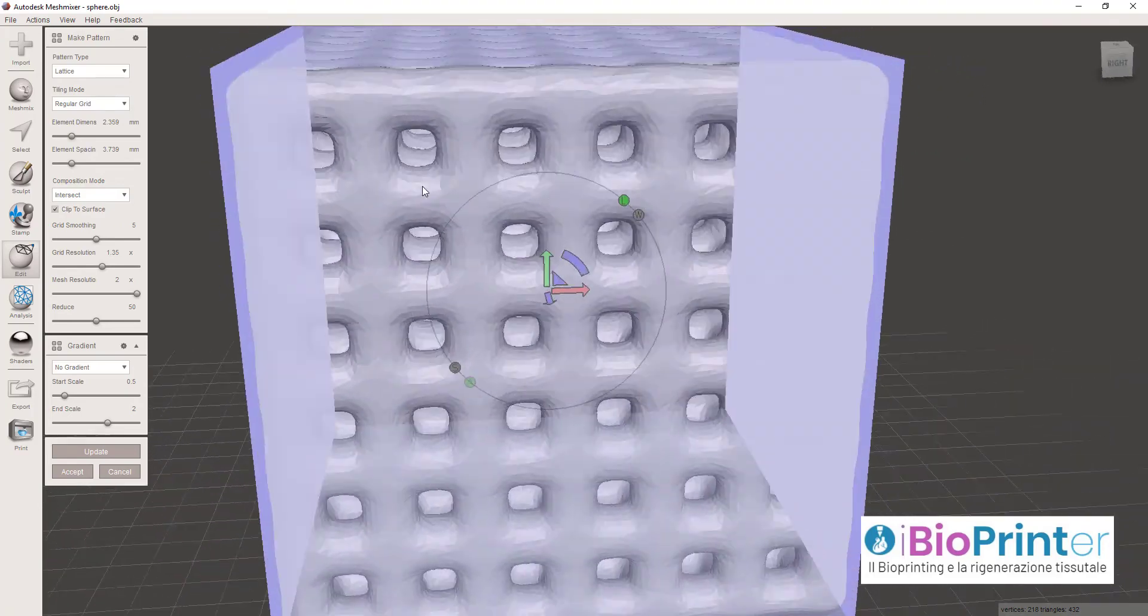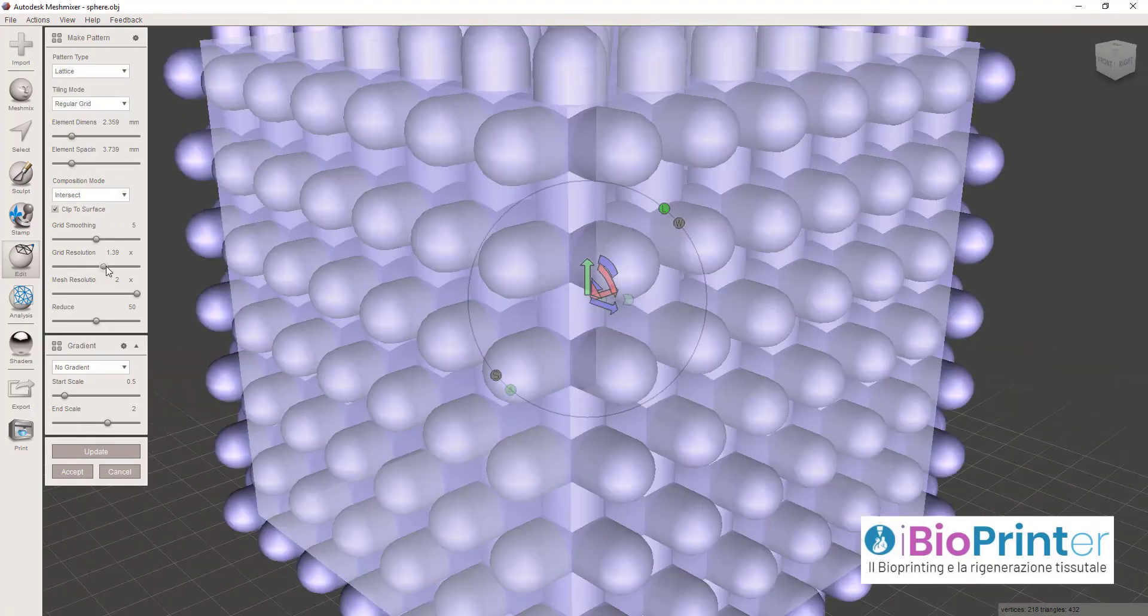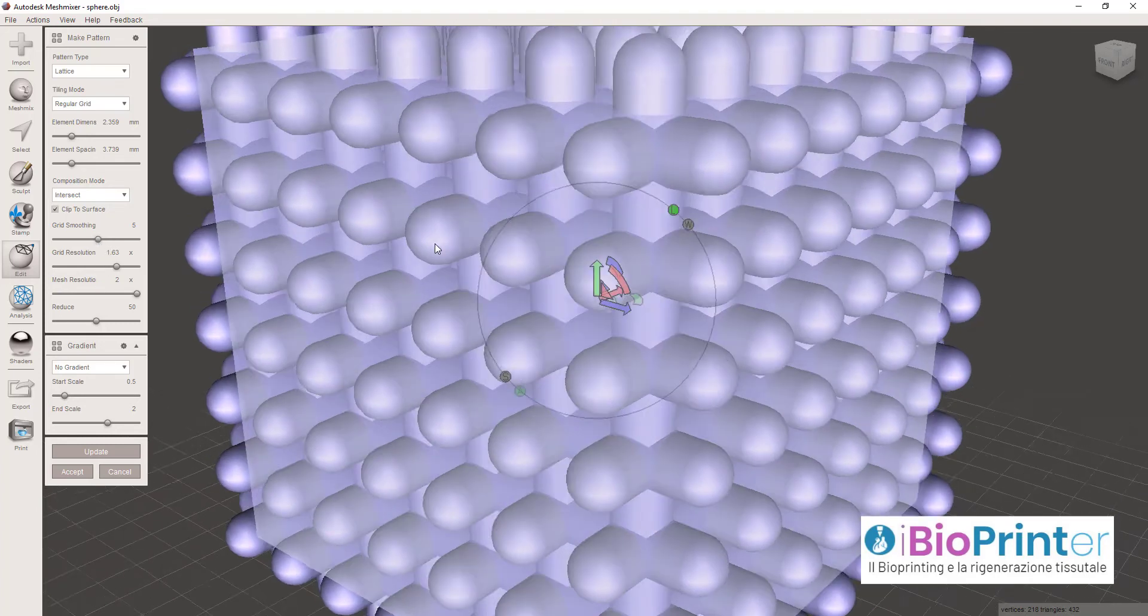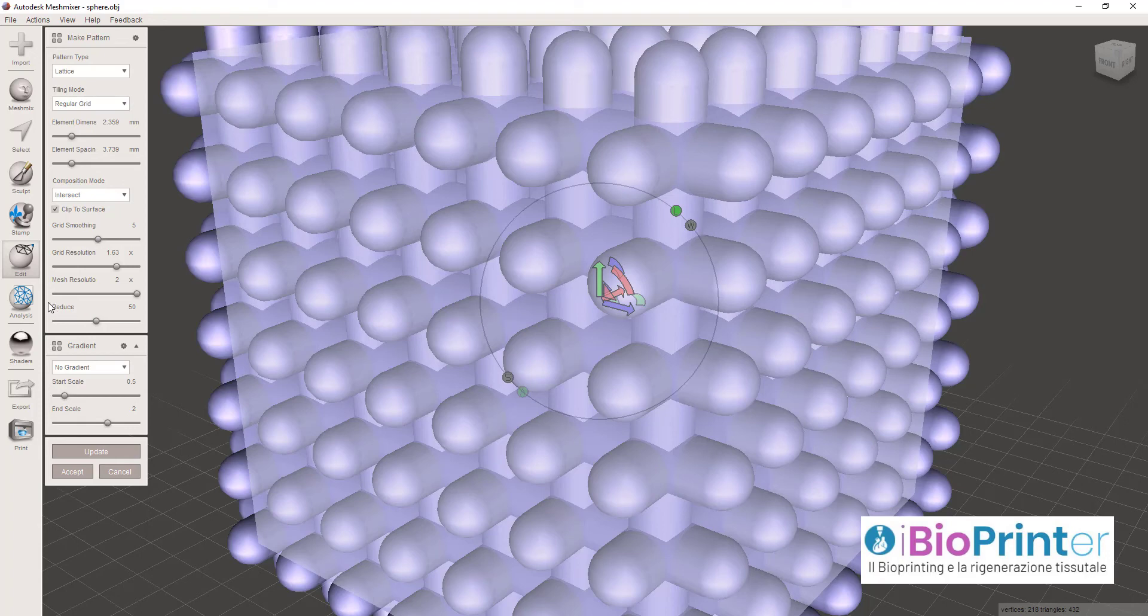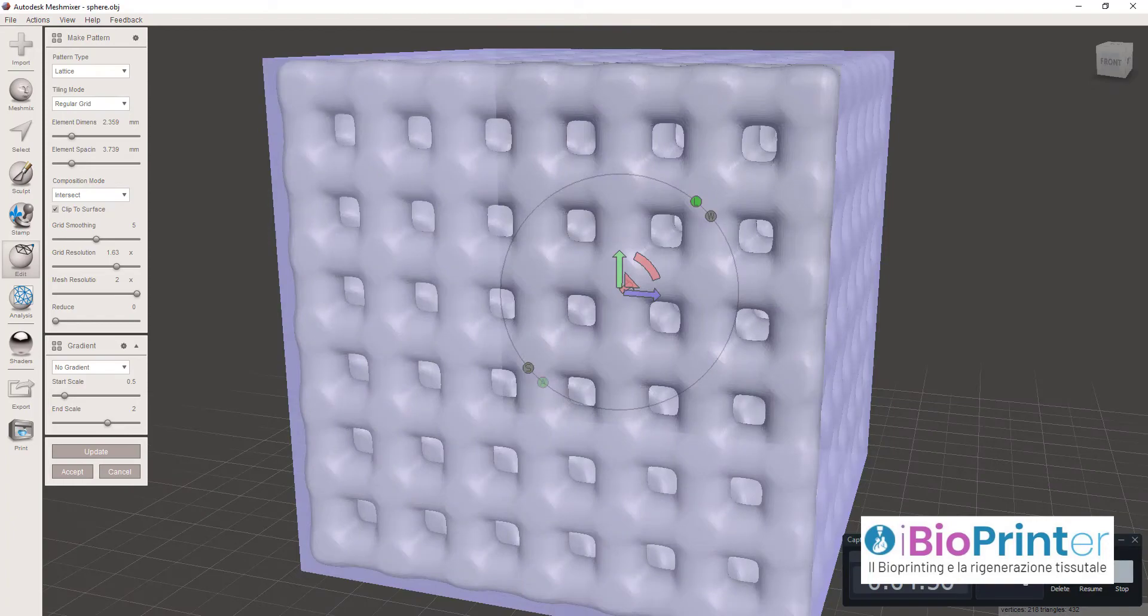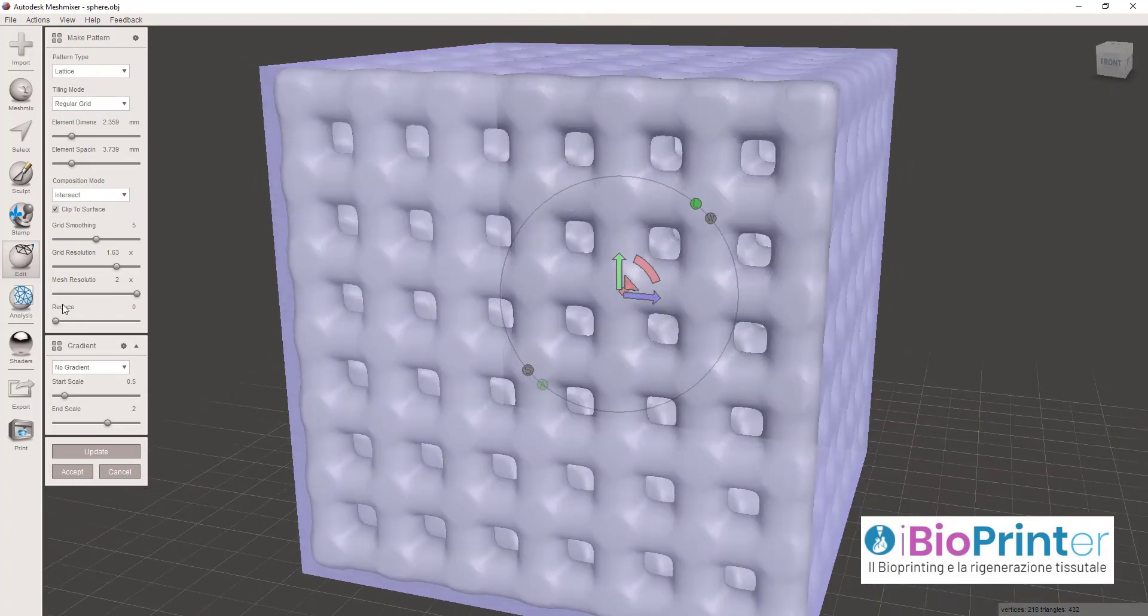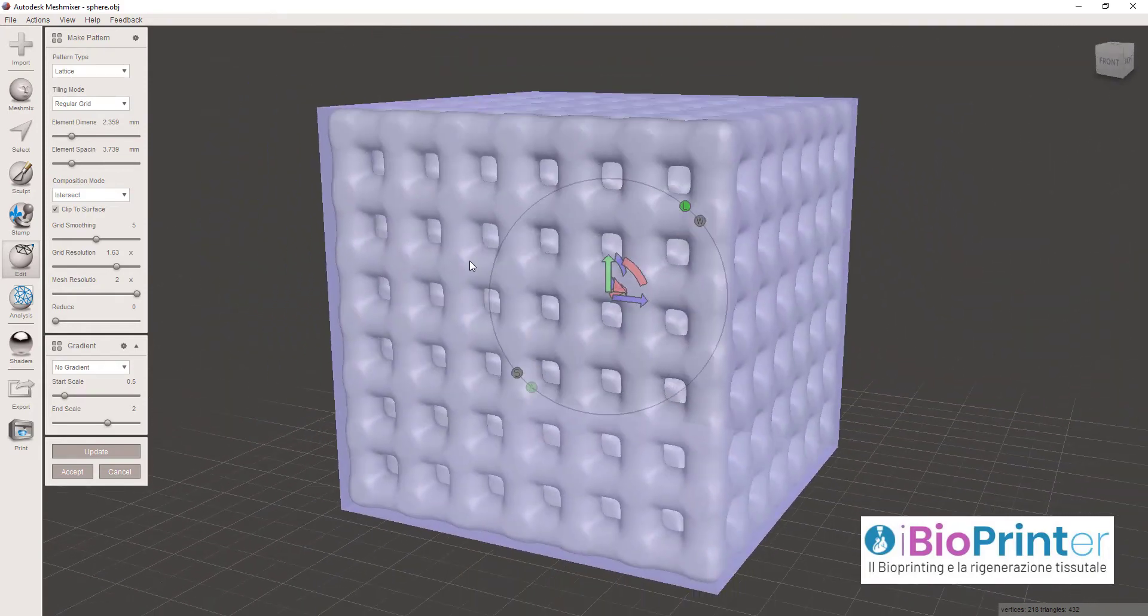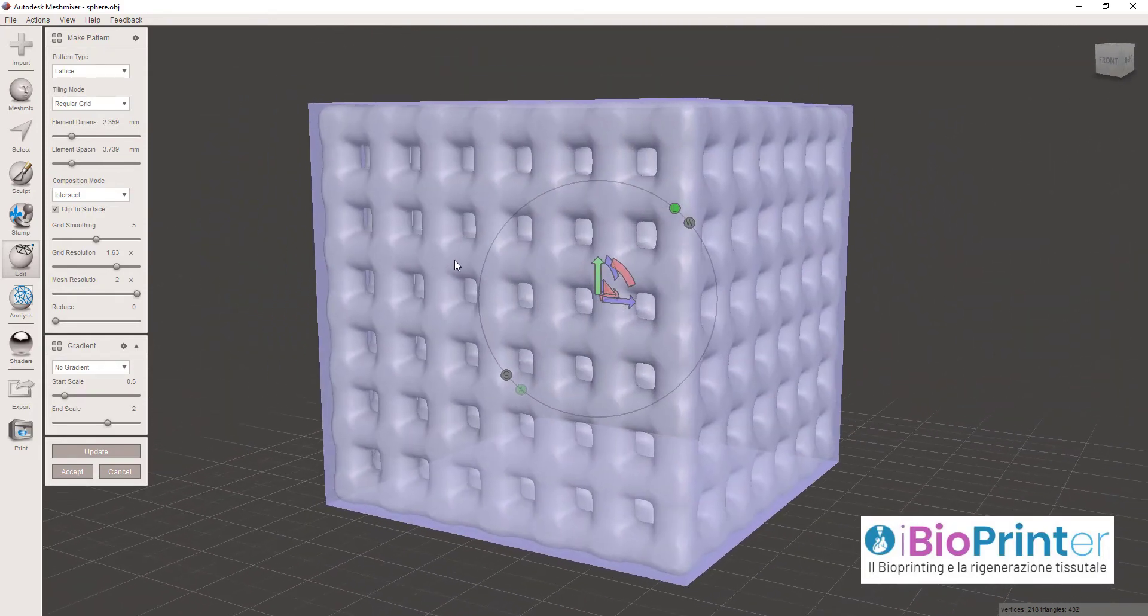Vedete che le sfaccettature sono aumentate. Cliccando su Grid Resolution e aumentando lo smoothing posso migliorare la qualità superficiale e posso anche migliorarla diminuendo il cursore Reduce. Invece di 50 mettiamolo a 20 e vediamo il risultato.